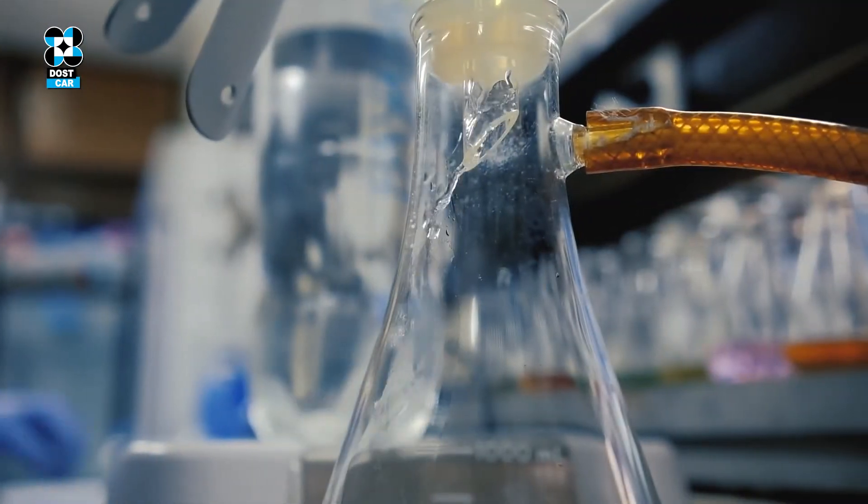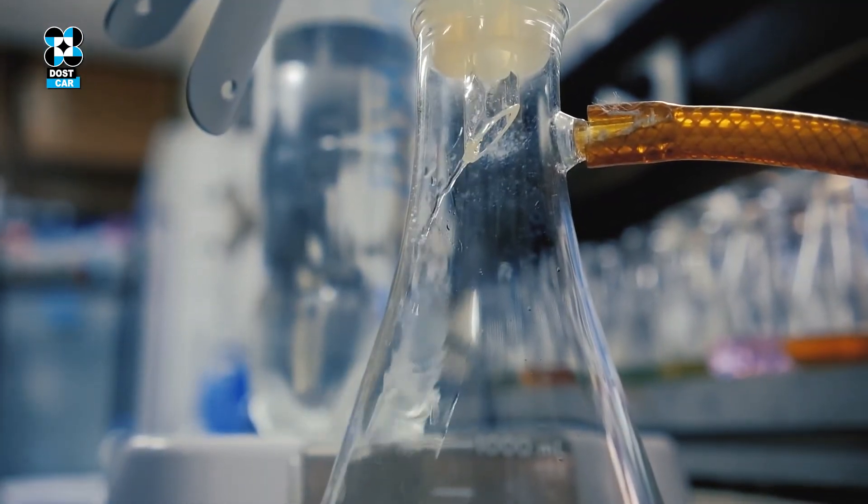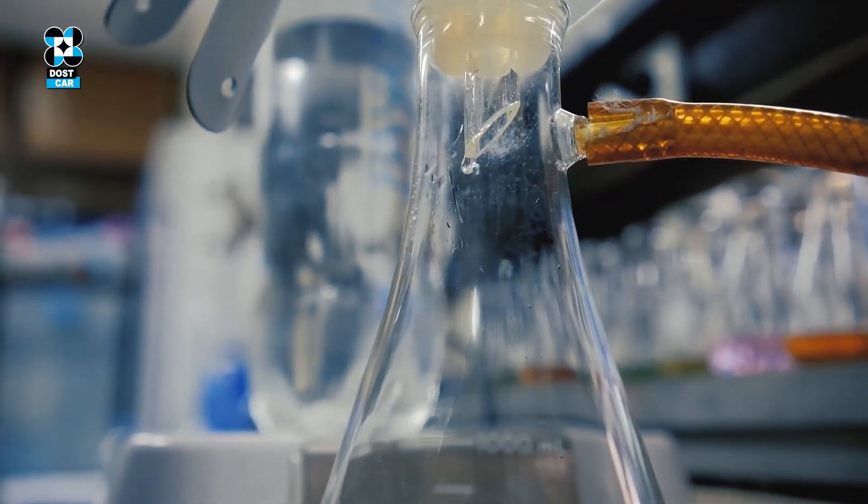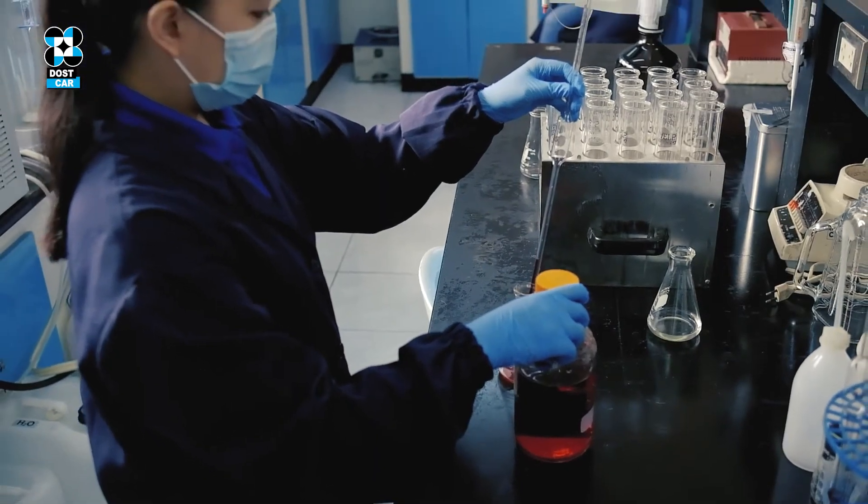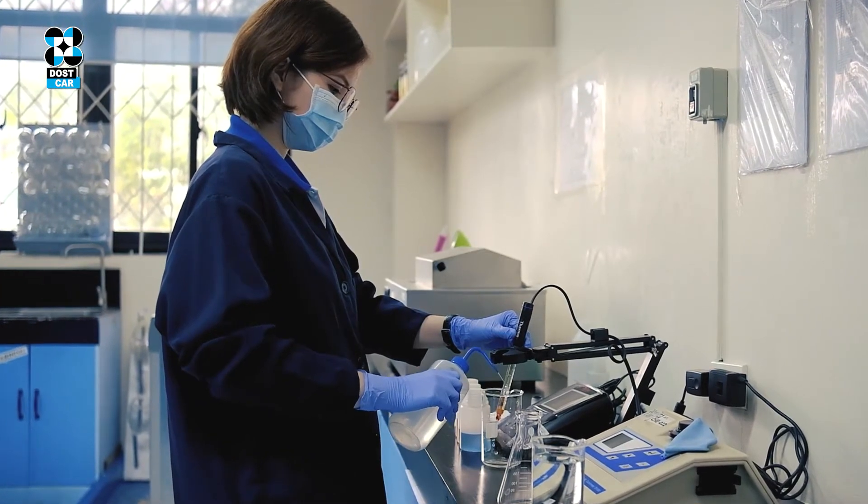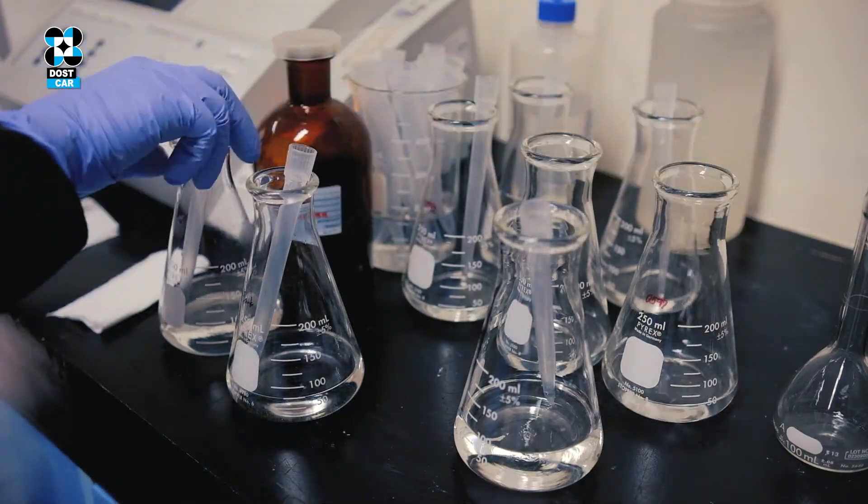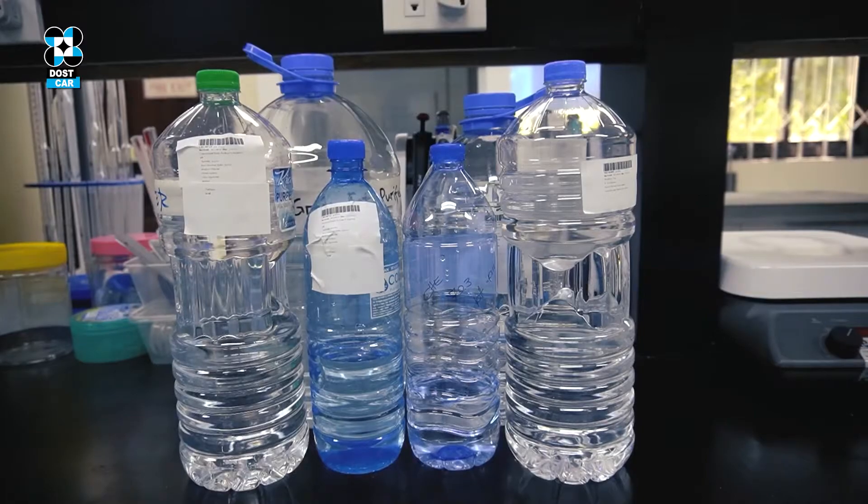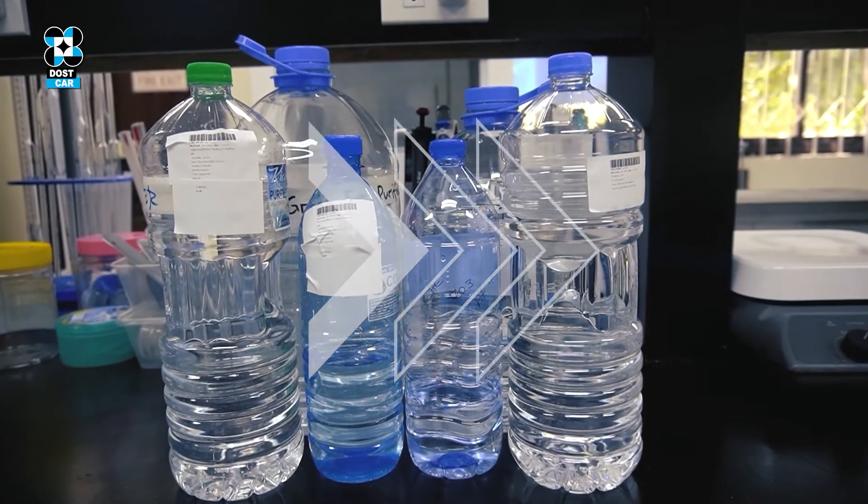Most of RSTL's customers are in the water business. DOST CAR takes pride in having a water testing laboratory authorized by the DOH to conduct bacteriological, chemical, and physical analysis of drinking water.